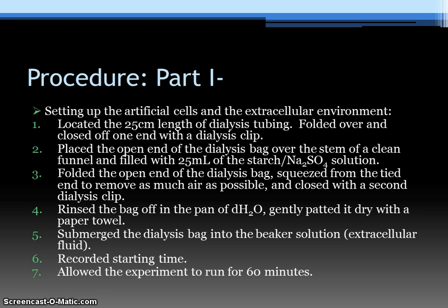Then we rinsed the bag off in the pan of deionized water and gently patted it dry with a paper towel. Lastly, we submerged the dialysis bag into its beaker solution, which was also the extracellular fluid, and we recorded our starting time, and we allowed the dialysis tube to remain in the beaker for 60 minutes.